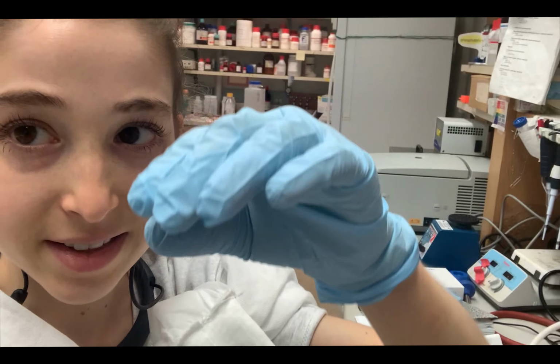Then you take that reaction and you put a little bit of it, you spot it, on these little filter papers. If you look at past methods papers, they call it P81 paper, because it used to be Whatman P81 paper, and then they discontinued it, and the whole kinase community was upset. And then the Oak Hill lab started making it, and we're like, yay!